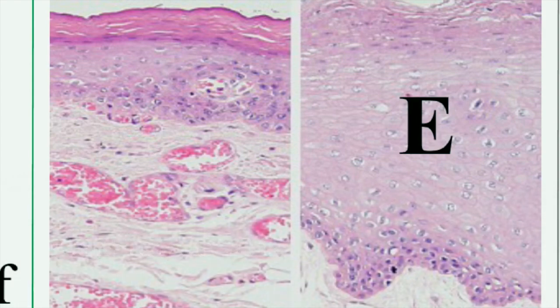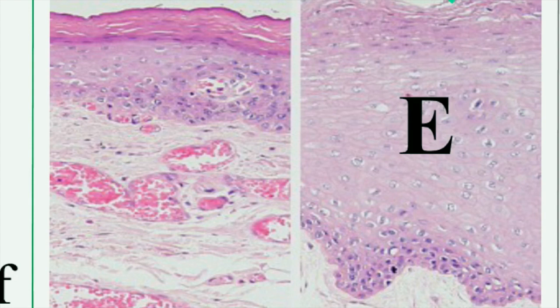This is a data show for the lip and tongue as part of the digestive system. In this picture we can see the epithelium of the oral mucosa, which is the non-keratinized stratified squamous epithelium — there is no keratin here. The keratinized stratified squamous epithelium is found on the outer surface of the lip. Underneath both, we have connective tissue.